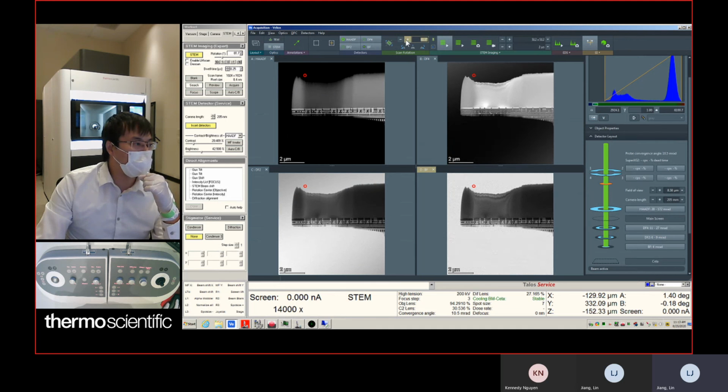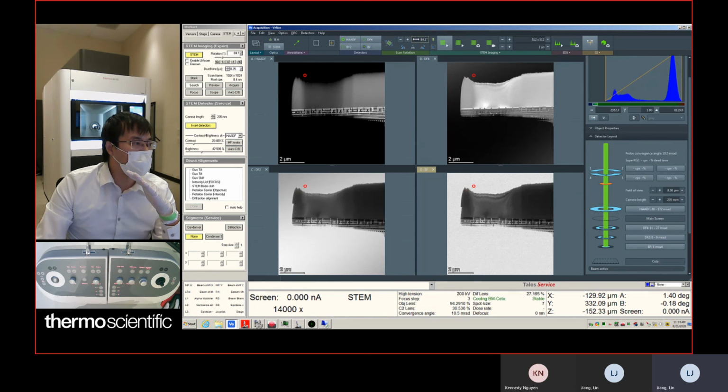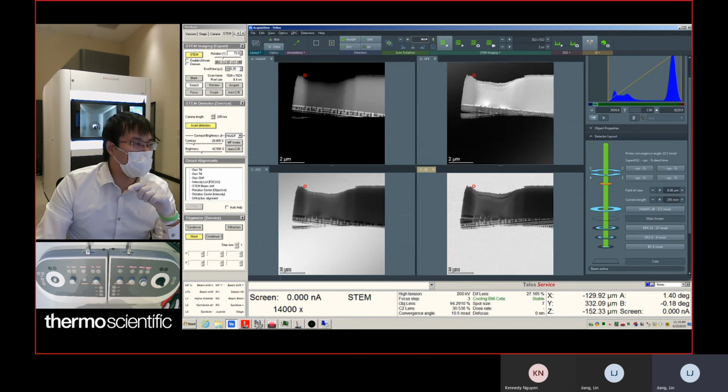Also, if you hover your mouse over the value here, you see left and right arrows. If you left click and hold and drag in one direction, it lets you change the value. Just hold the left click and move left and right to change the value.